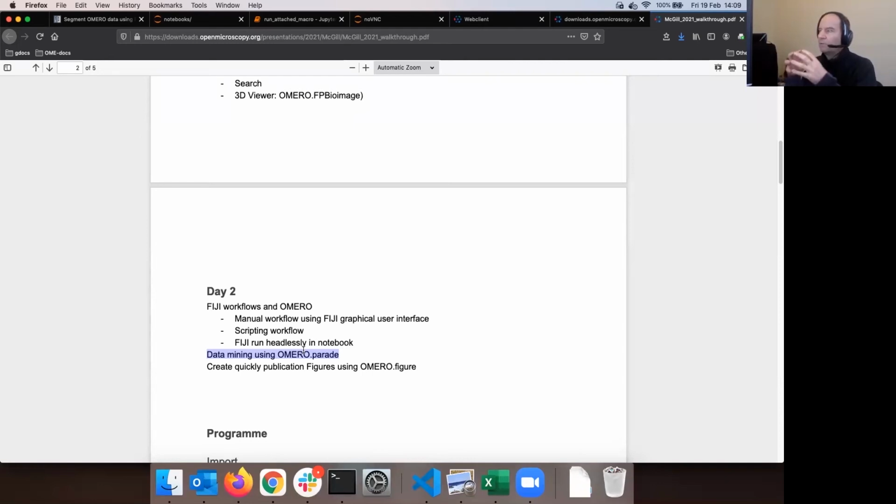Okay, so it will really matter what size of the ROI, let's say, has this image or that image in order to be found or highlighted in such an approach. And then it will culminate in the creation of a figure, as usually scientific walkthrough does, for publication, or even for sharing with your colleagues in your lab, with your boss, etc., or with some peers in other institutions.